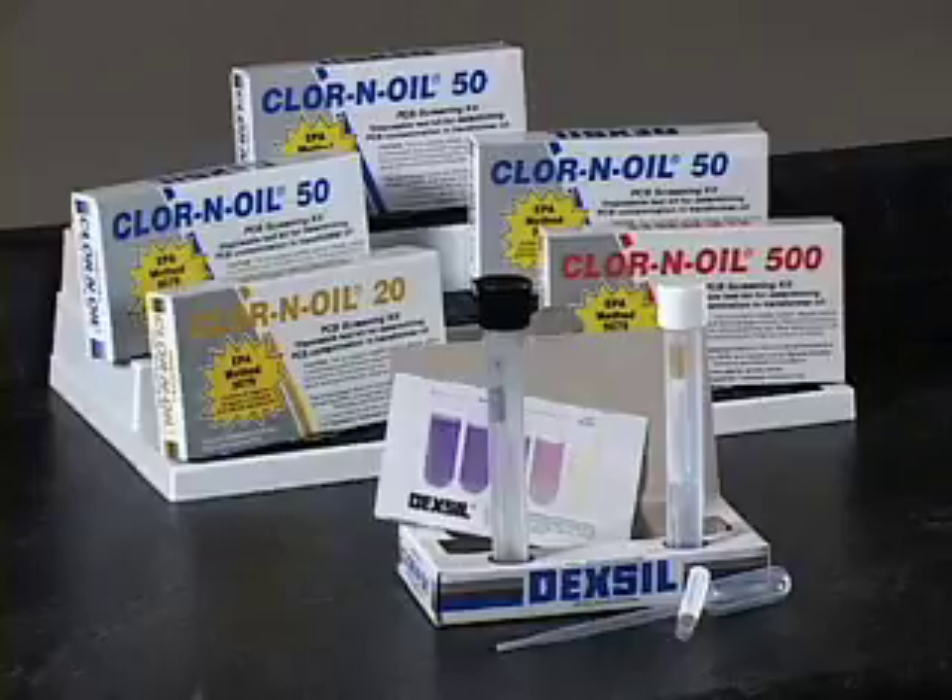When excess water is present in a sample, the metallic sodium reacts preferentially with the water and can't react with the PCBs, invalidating the test. Important: samples containing excess water may cause false negative results. One way to determine if a sample contains too much water is to observe the reaction when the sodium reagent ampoule is broken.